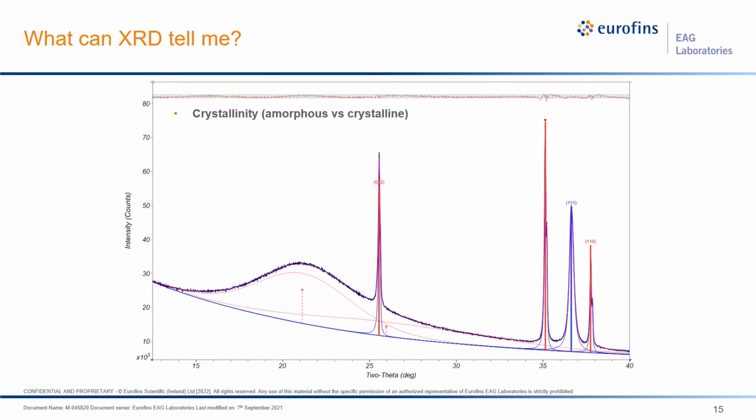We have a number of diffraction peaks, some more narrow and some more broad. While the sharper peaks on the right are coming from crystalline materials, there's also a broad band located towards the left of the plot that represents an amorphous component of the sample. Using the ratio of peak areas from the sharp peaks versus that of the broad peaks, we can estimate just how much of the sample is crystalline and how much is amorphous. As an example, this type of analysis may be used to determine whether, say, a coating deposited on a representative substrate is amorphous or if it has crystallized due to annealing.